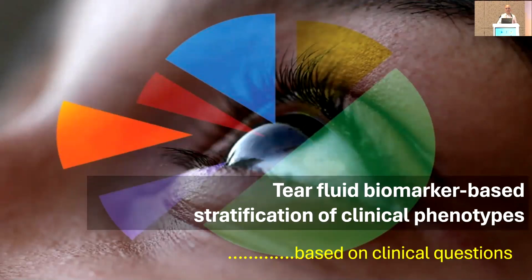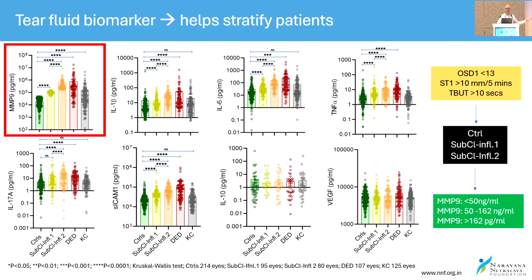Yes. So most of the work transferring from the patients to the lab is based on tear biomarkers. So how does it look when we collect the tears after you collect the Schirmers, when it goes back to the lab, and when we plot graphs like these? Where do they come from is what we wanted to show. And there are two ways it can happen. One is through flow cytometry.